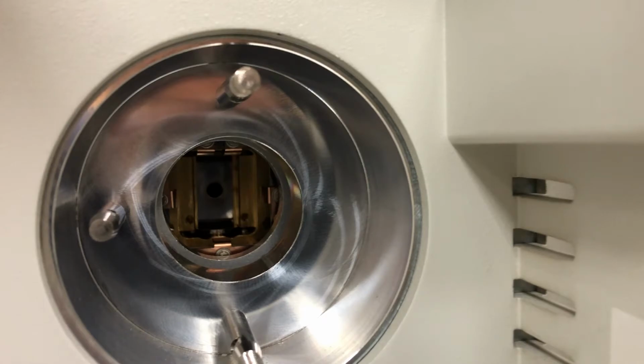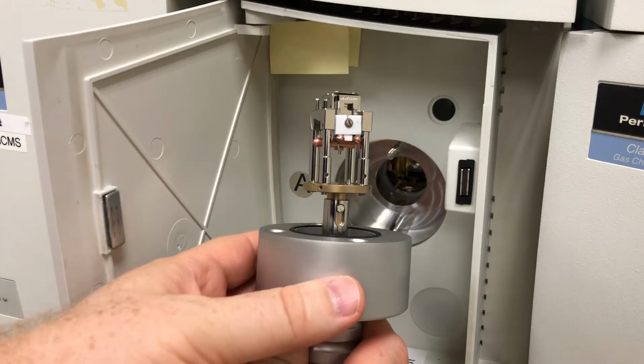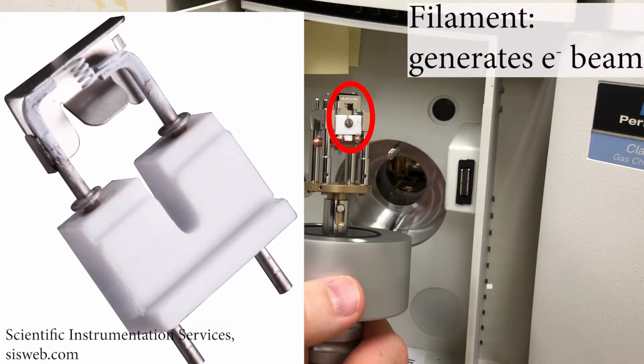So we pull the source out, and we look down the barrel here. You can see the beginning of some ion optics. It's really hard to see, but if you look on the right, you can actually see the column poking into the ion source. So we have the GC column feeding directly into the ion source. It feeds the gas in, it gets ionized in the source. Let's take a closer look at this chamber here.